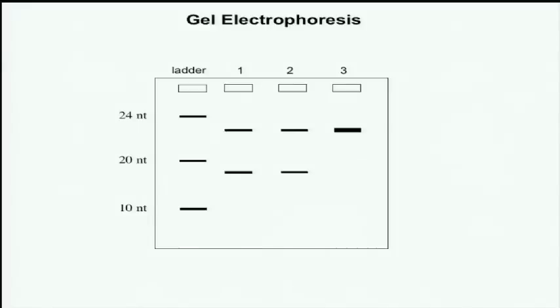So when we were in lab, you saw a picture of a gel that looks a lot like this slide here. As you can see in this slide, some people show one band of DNA, other people show 2 bands of DNA. Well, why is that? The reason is that people who only show one band of DNA actually have double that amount of DNA, as you can see in the difference in the intensity of the band.